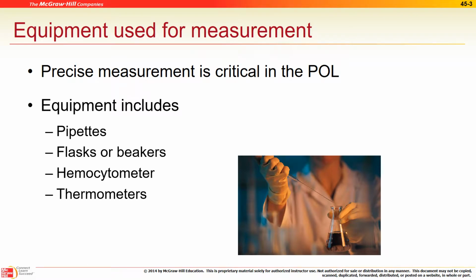Precise measurement is important, so you'll use pipettes and sometimes even micropipettes that can go down to 1 microliter. That is what, a thousandth of a liter? No, one millionth of a liter. That's small. So those are the micropipettes. You should be able to dispense 1 microliter worth of fluid. That's crazy accurate. That's like the equivalent of one droplet, right? Yeah, it's even smaller than a drop.